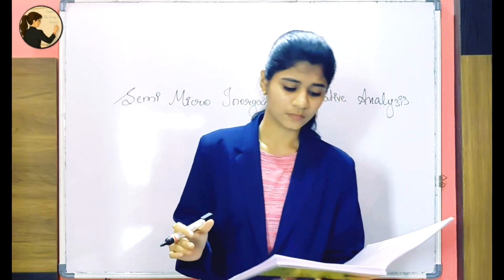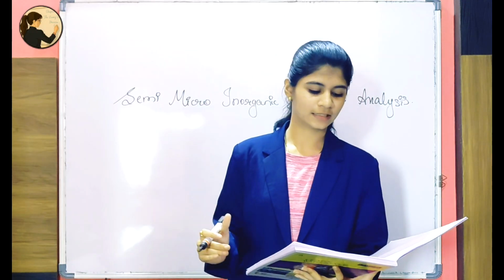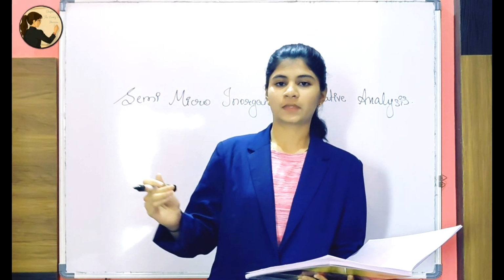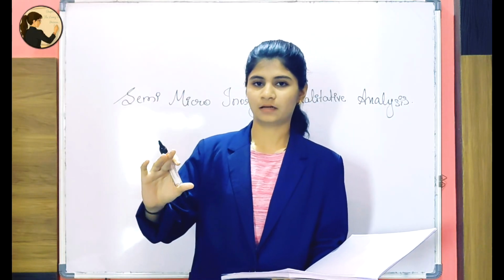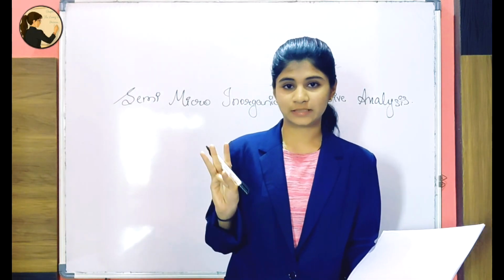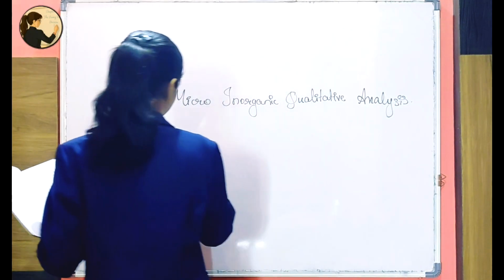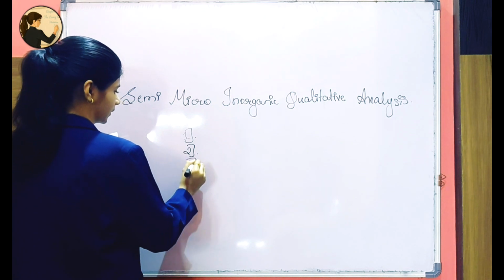So let me start. The semi-micro qualitative analysis of a simple inorganic salt is conducted in the following steps. If you start solving the salt analysis in the form of the writing part, there are only 3 parts that you will get in your exam.